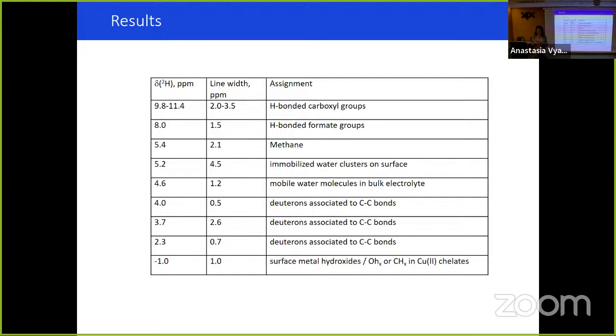The second question was why NMR? As I mentioned, one of the advantages is that it is a non-invasive technique. We can provide the reaction, or we can put some starting material, let it work, and measure all the time, non-stop. So this is an endless experiment. And the NMR time scale will be very different from the electrochemistry. So why put the electrochemistry device inside the probe? I could have it outside and have the flux coming in and out.